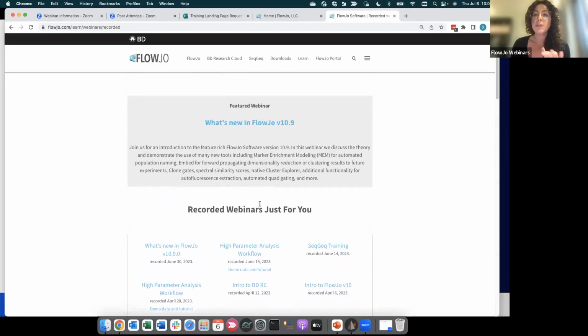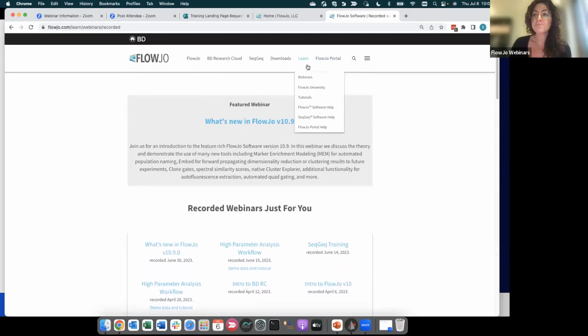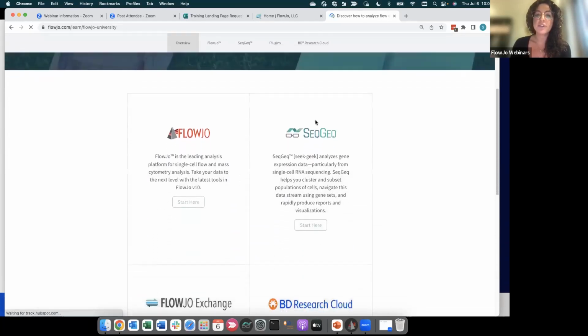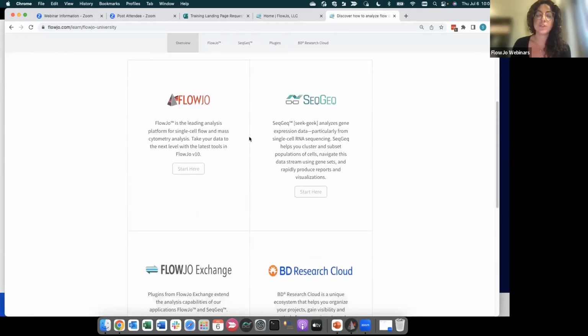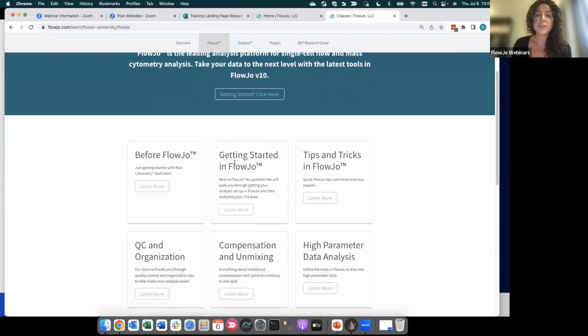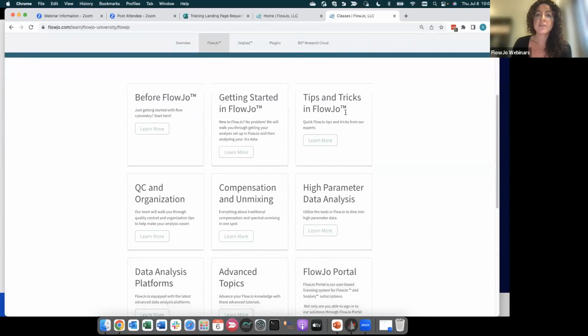This webinar will be about an hour. But if you don't have an hour to watch a webinar, you can always navigate the FlowJo University, which is a repository of short videos on all the different tools and tasks within FlowJo. If you navigate within the FlowJo area right here, you will find all the different topics. For example, you can find tips and tricks in FlowJo or how to get started.